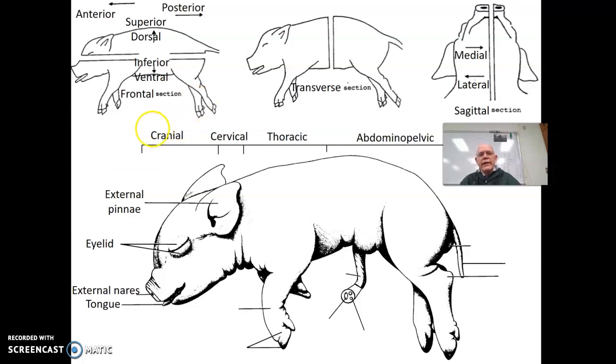If we go on to the leg, you have to keep in mind that the pig is actually running up on his toes. In fact, to be more specific, he's running up on his toenails. So things kind of move up from where you might think they would be in the human body. This right here is like his wrist. It's a little higher up, but here are his toes and the phalanges, and then there are carpals in here, and then this would be the wrist.